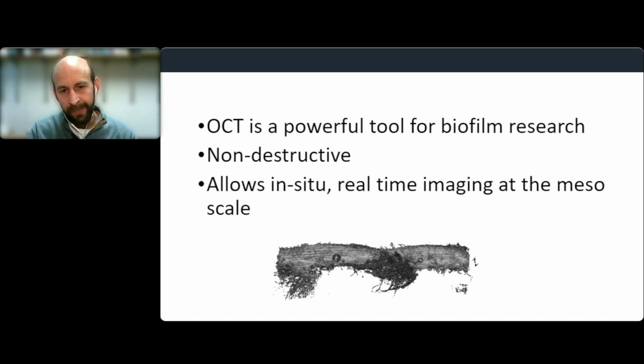If I were doing confocal microscopy and looking here or looking here, I would see two different things, and maybe I wouldn't realize why. Or maybe I wouldn't even realize that I should be exploring these two different locations, even though they behave very differently.